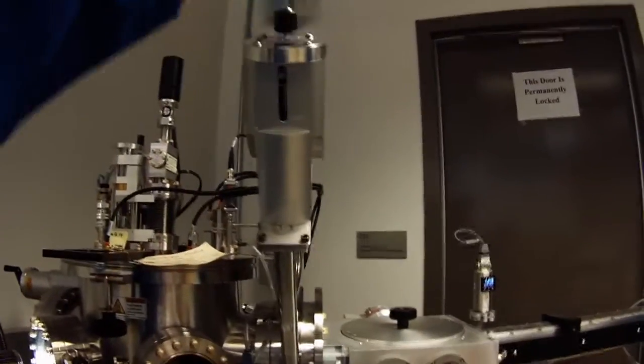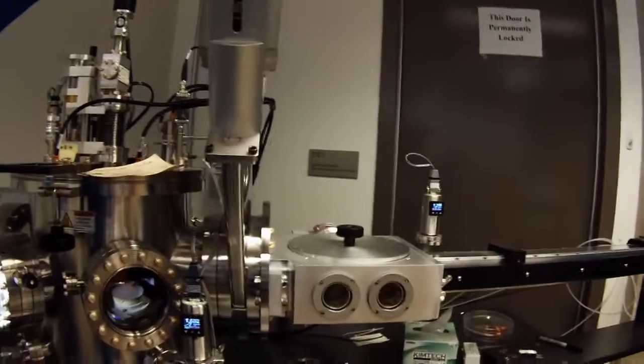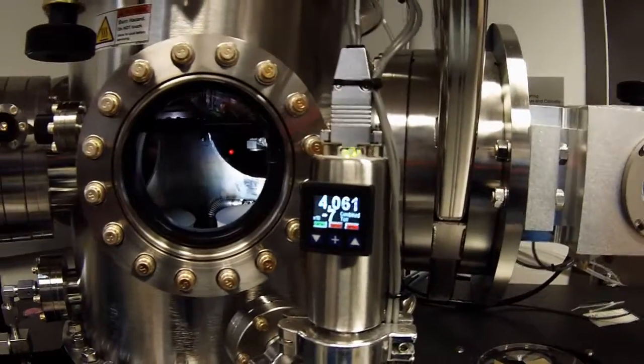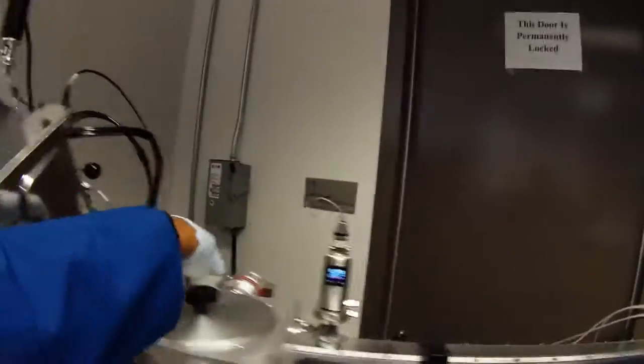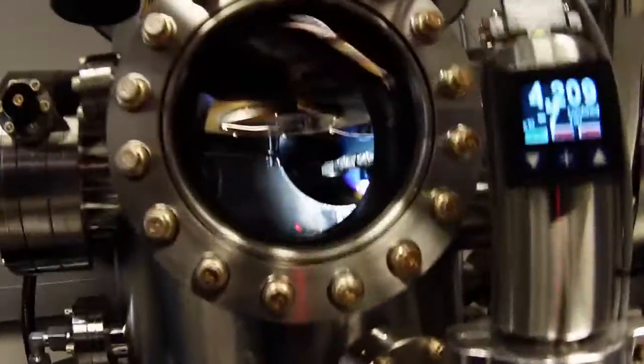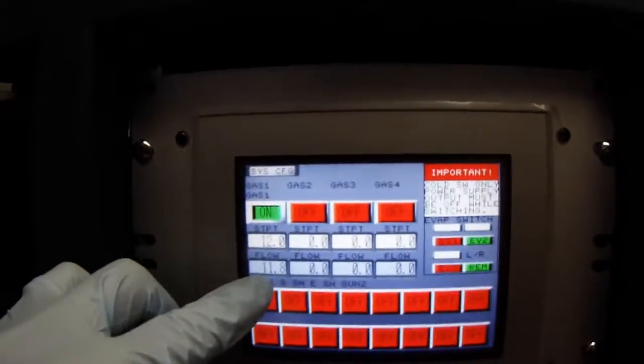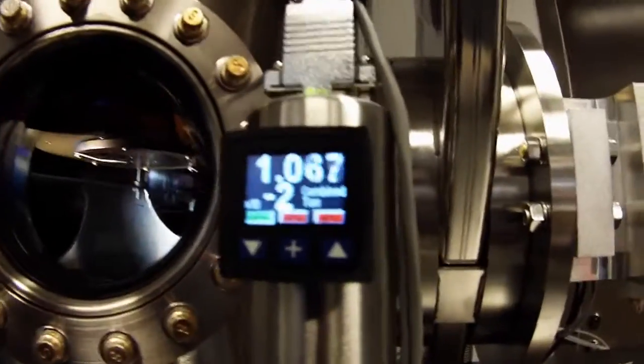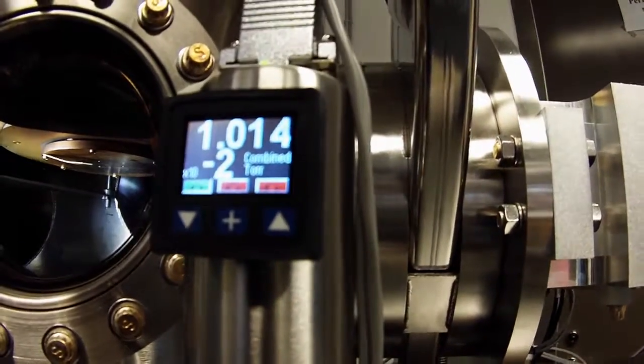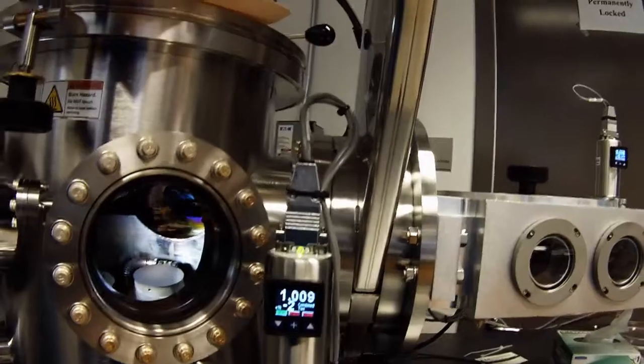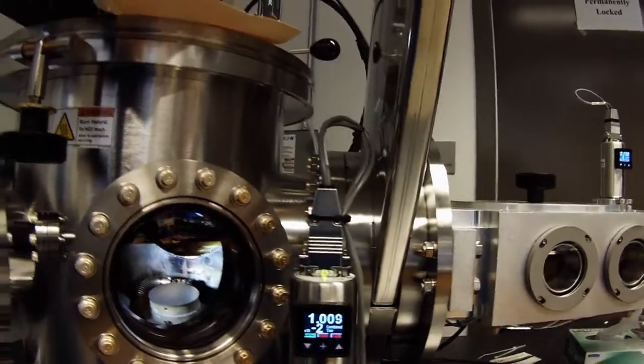The load lock chamber and main chamber are still open to each other, so let's close that now that we've pulled the load lock all the way back. You can see the pressure is starting to go up because the turbo is closed and we don't have its assistance since these chambers are closed off from each other. Let's turn on the gas - right now it's at 12 standard cubic centimeters per minute. Turn the argon on, you see the pressure spiked up, and now it's stabilizing at about 10 millitorr.